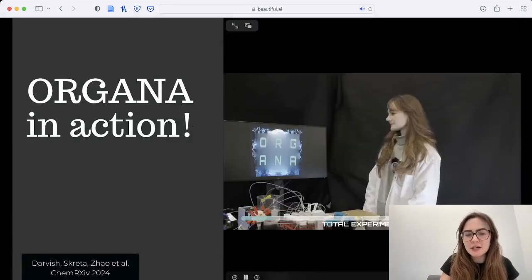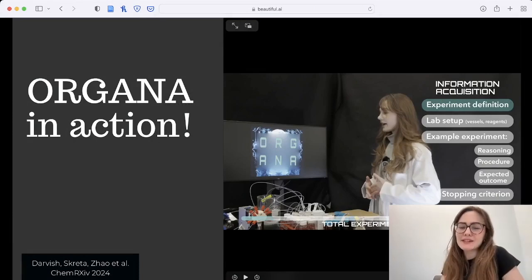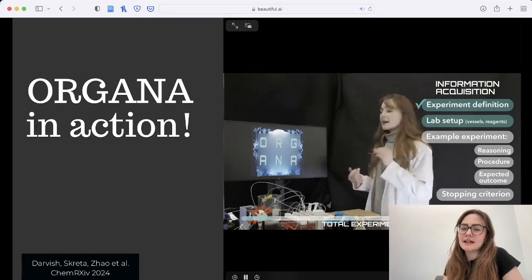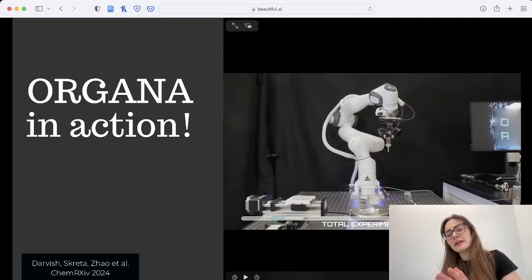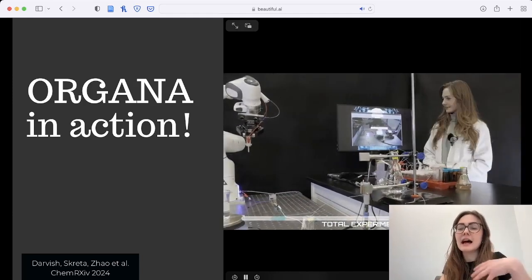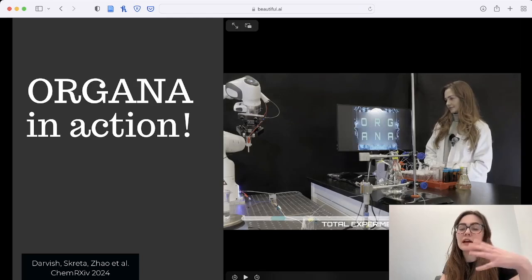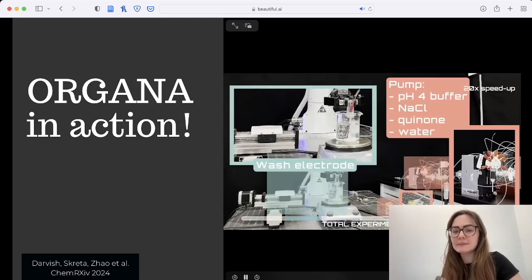Here's a video of ORGANA actually working in the real world. In this first phase, I'm interacting with ORGANA to figure out the goals of the experiment. Then there's a grounding phase where ORGANA perceives the scene. Right now it's detecting all of the tools and vessels, and then it's asking me if I can identify what each one is used for. Now ORGANA is actually running the experiment.